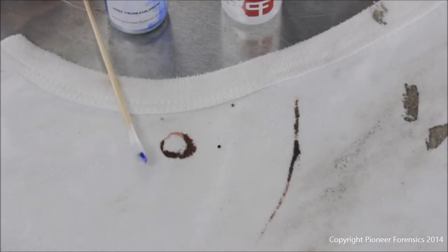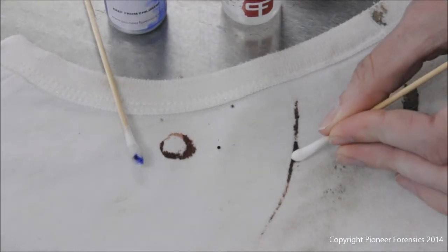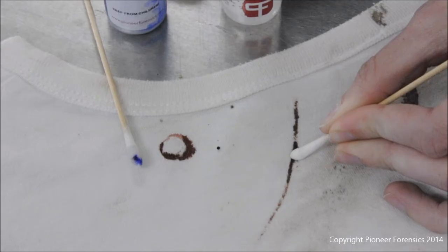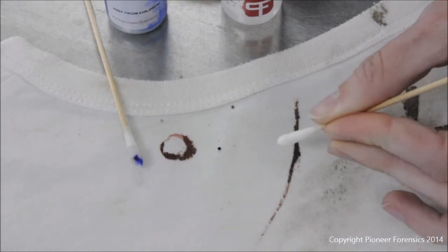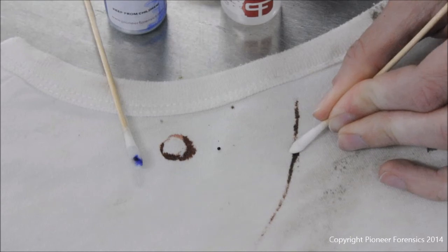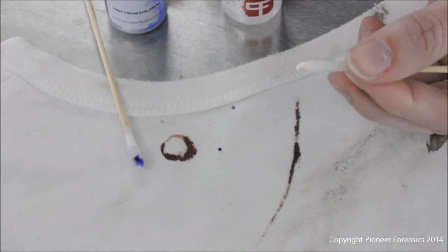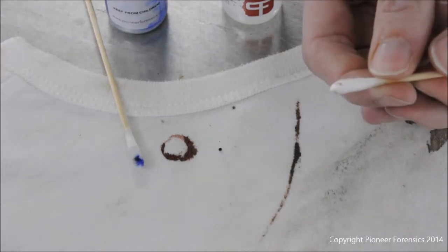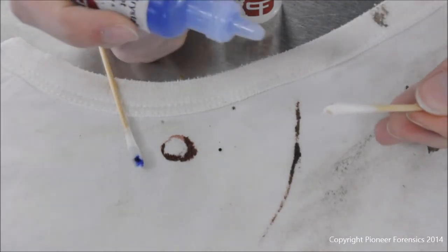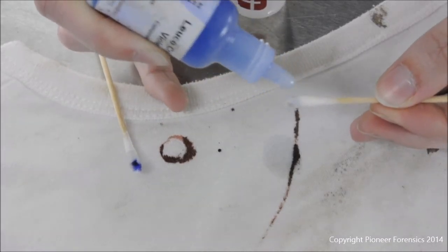The substance you are examining is blood and is not a foreign substance that takes on the appearance of blood. As helpful as presumptive testing can be at the crime scene, anything that does test positive and you need to know the source material should be submitted for additional tests that'll reveal the identities of the people who left the blood.